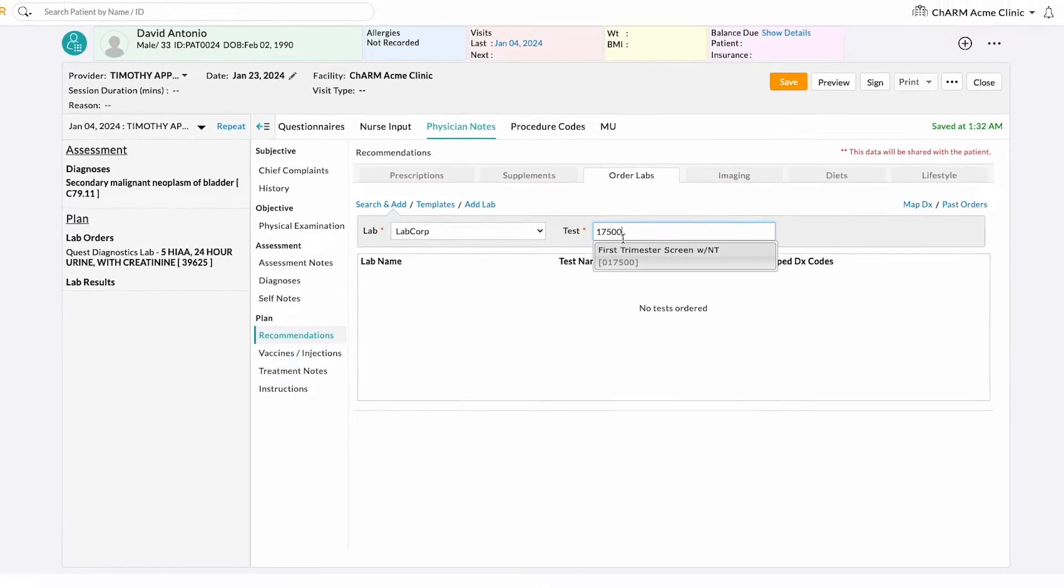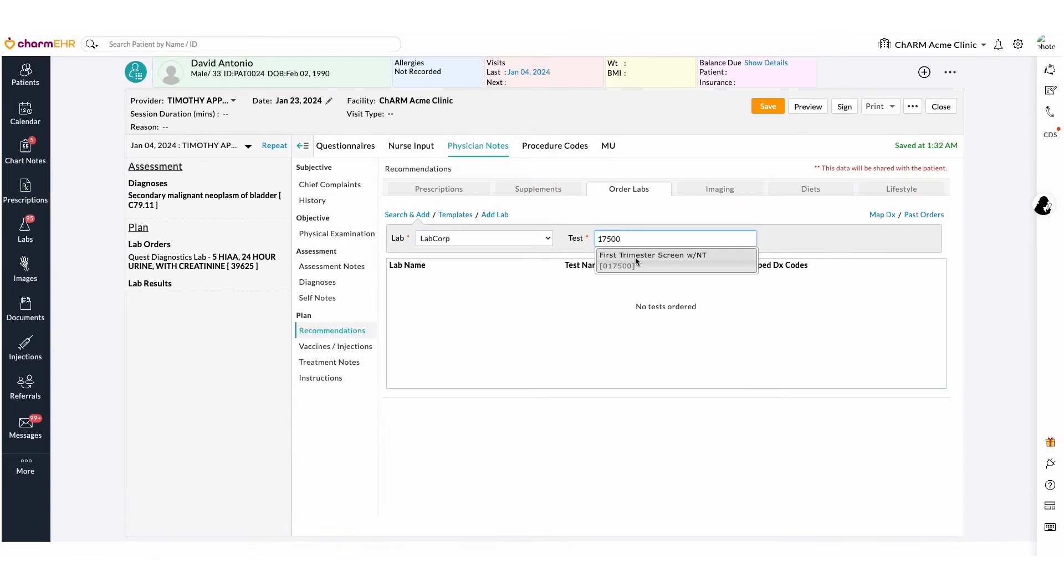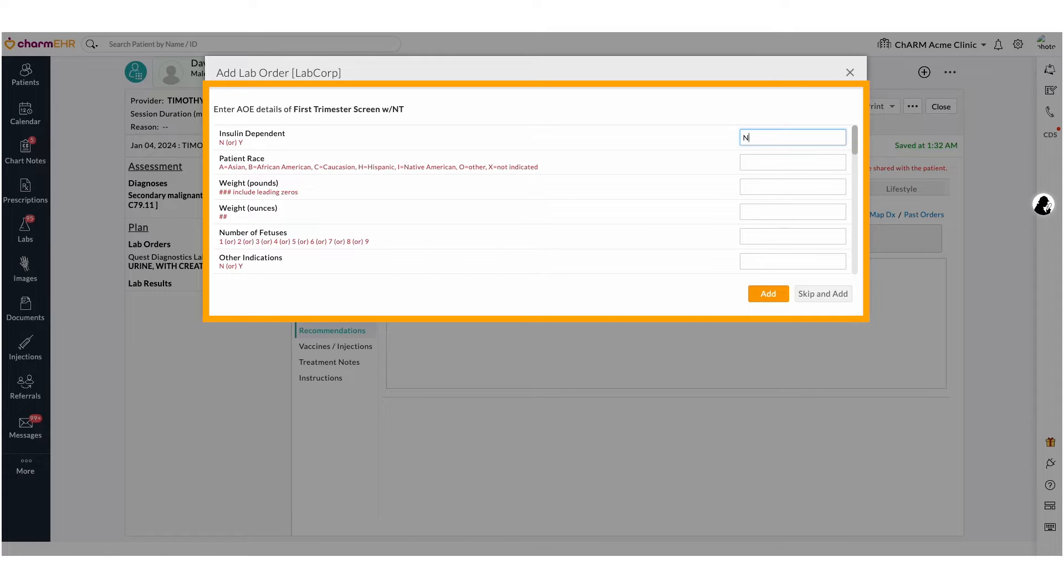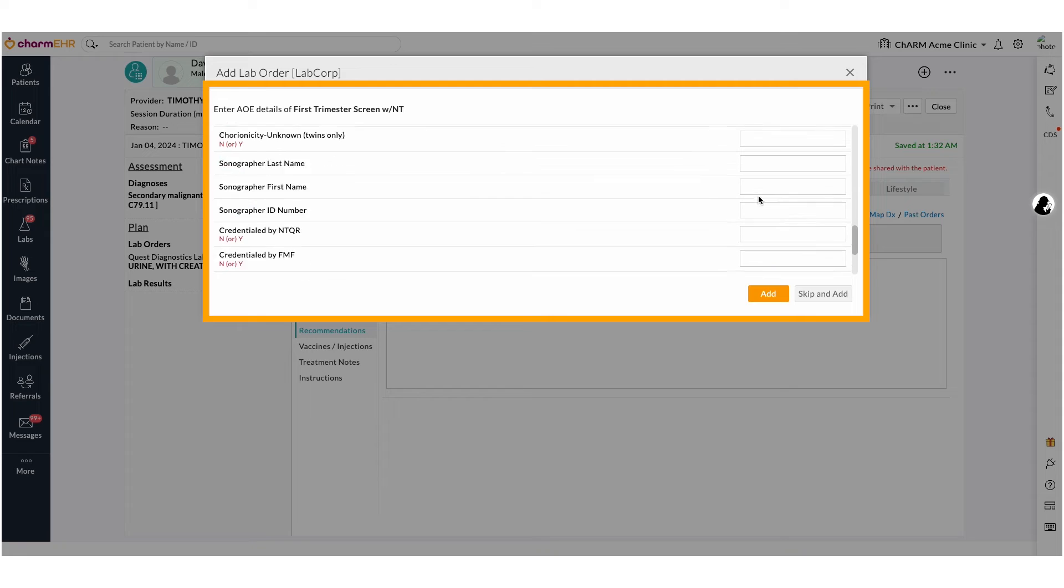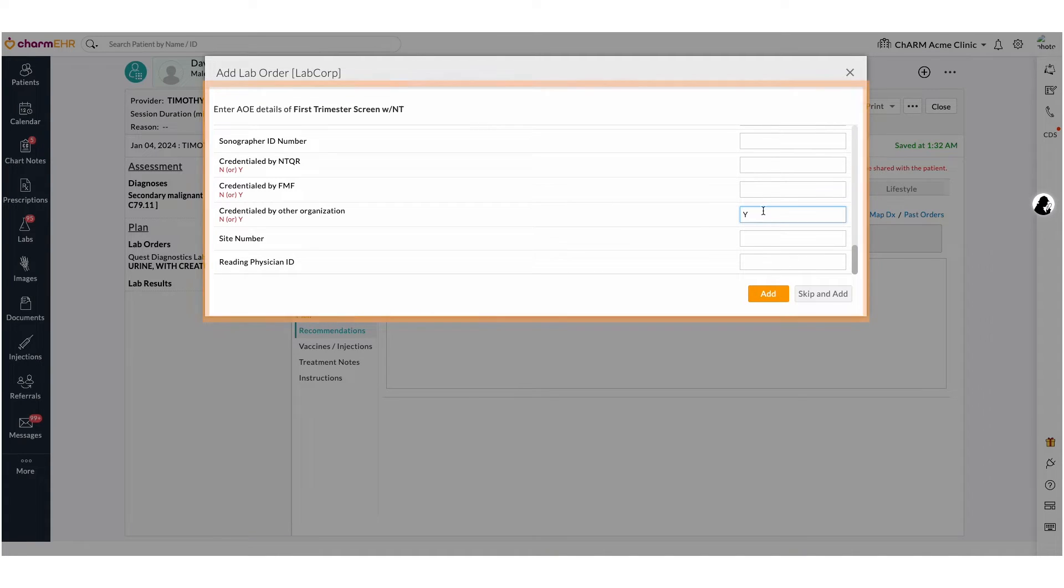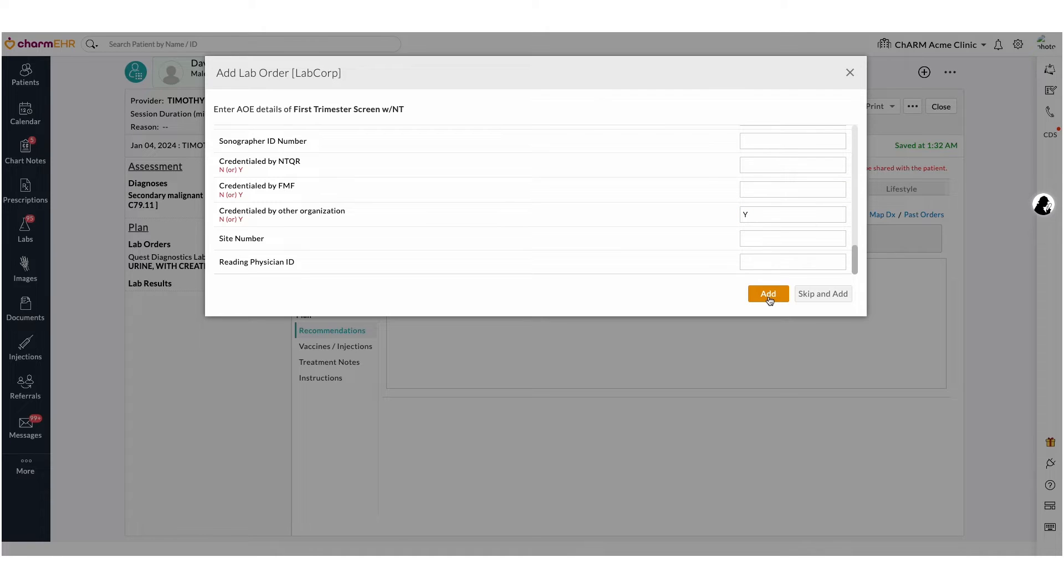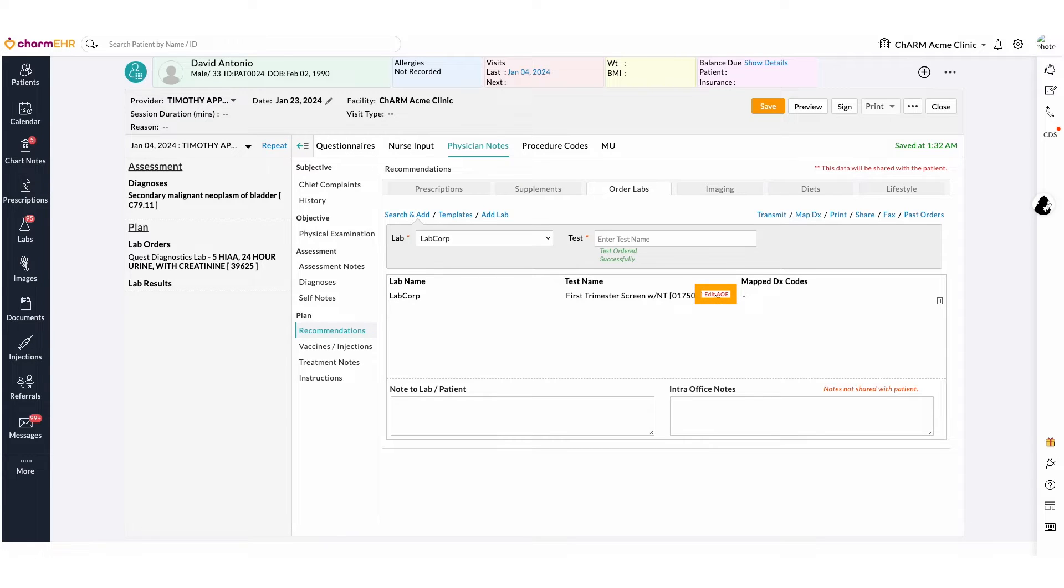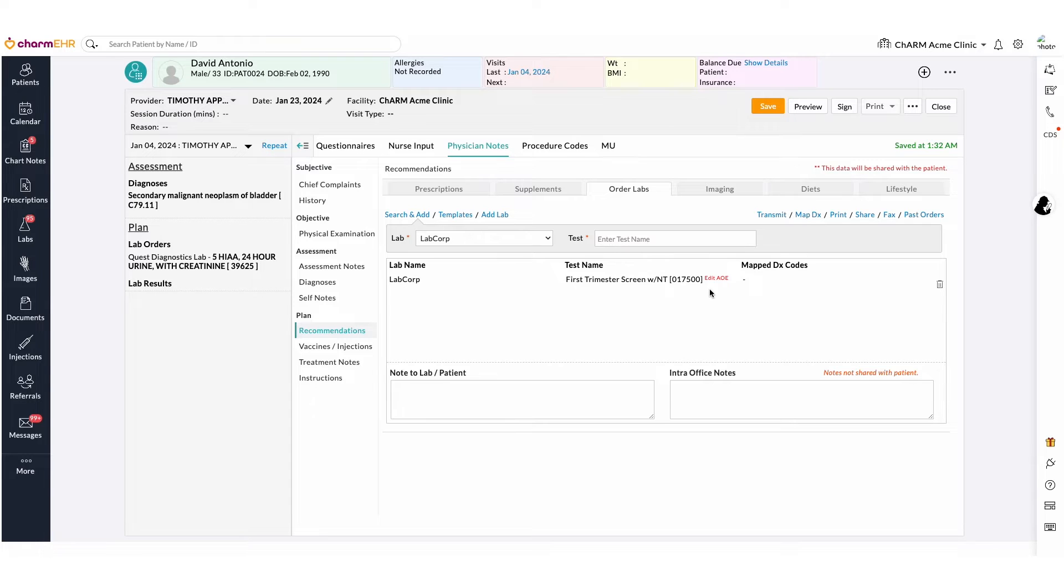Selecting the test will add it to the chart note. If the selected test has Add Order Entry or AOE questions, fill in the answers and add the test to the chart note. Edit AOE option can also be used to edit the filled in AOE details. Multiple tests can be searched and added to the lab order.